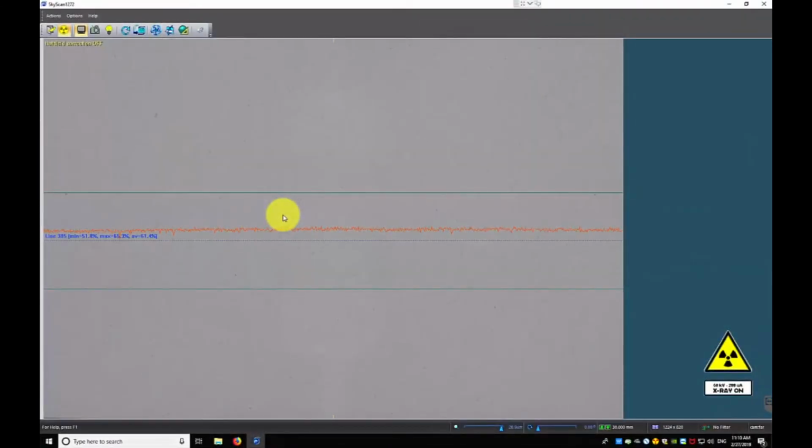Now that the automated flat field correction process has completed for all of the offset camera positions, we are ready to start setting up our offset scan. The first step in doing so is to re-enable the flat field correction on the current view. To do this, we move our mouse back to the top left corner of the screen, double click once, and we will see that the flat field corrections are applied and our corresponding transmission values are increased.